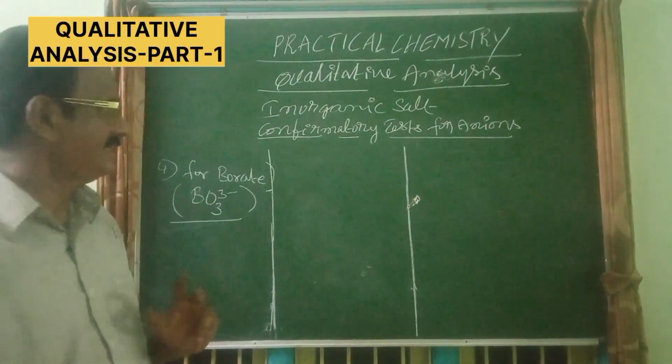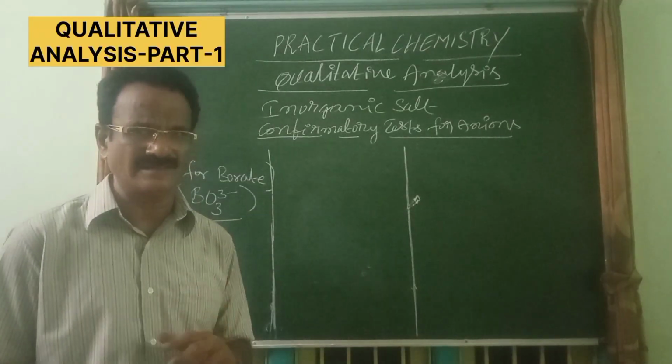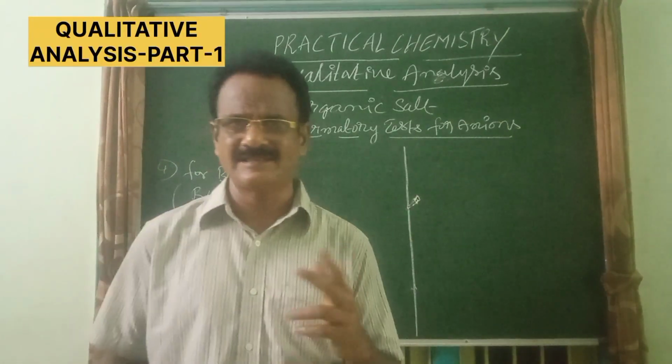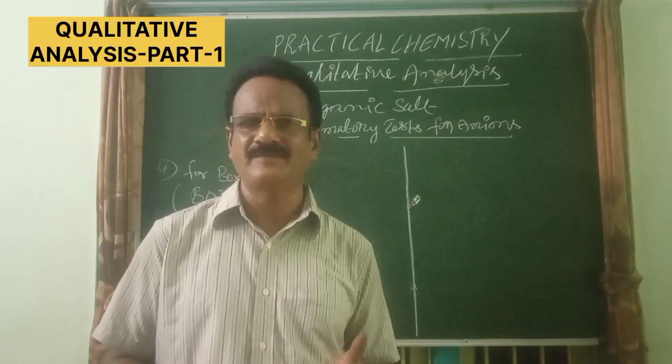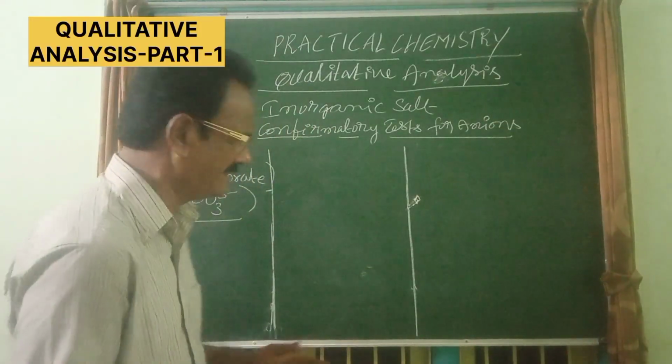Okay, so here this is nothing new, I think, because the identification test is equal to the confirmatory test in the case of borate and acetate also. Let us see.